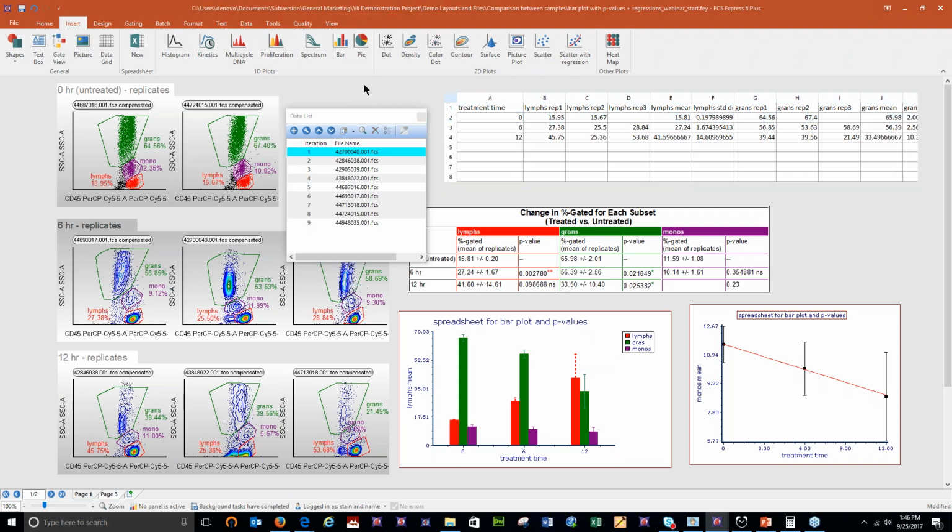All right, so any other questions about this layout before we quickly move on to an example of a high throughput screen pilot study?